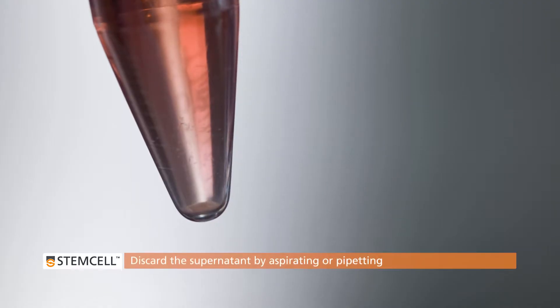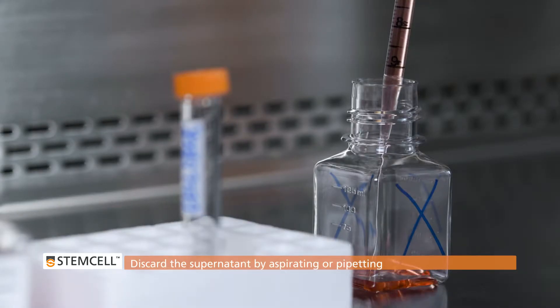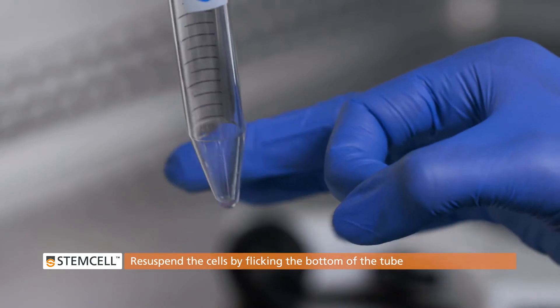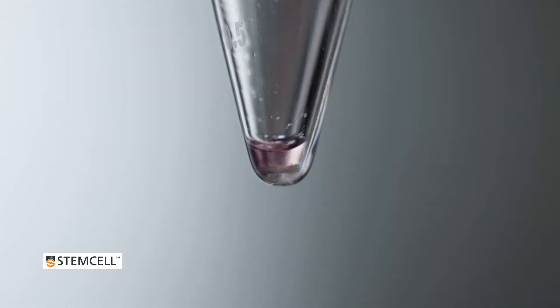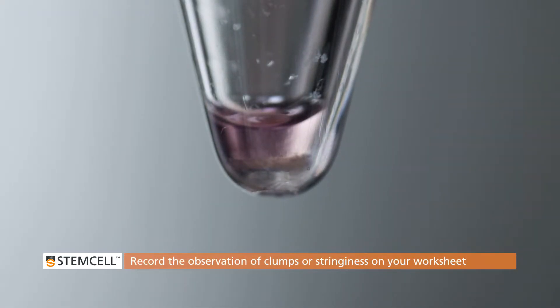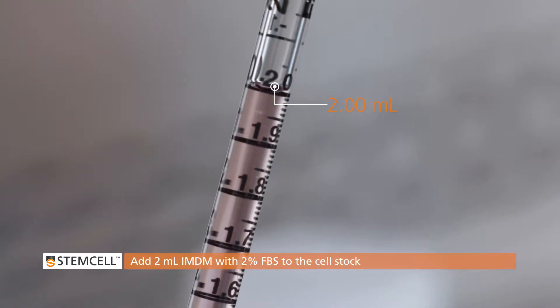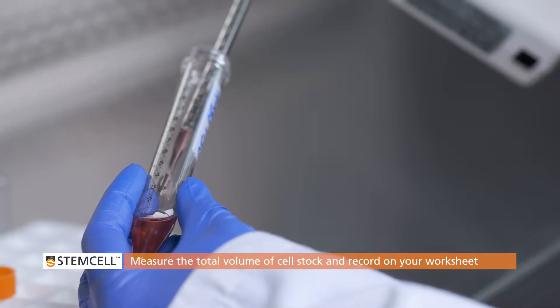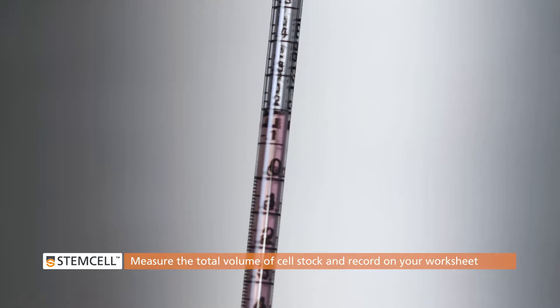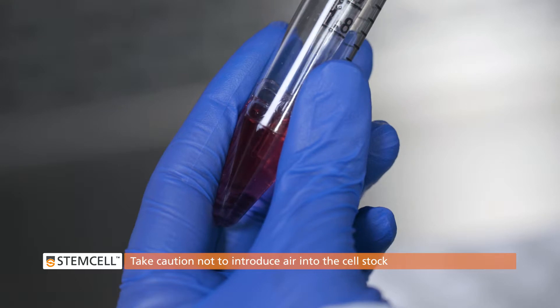Carefully discard the supernatant by aspirating or pipetting — do not pour off. Re-suspend the cells in the remaining medium by flicking the bottom of the tube. The cell suspension should be homogeneous and clump-free. If you observe clumps or stringiness in the sample, please record this on your CFU assay worksheet. Add 2 mL of IMDM to the cell stock. Using a 2 mL serological pipette, measure the total volume of the cell stock and record this value on your worksheet. Take caution not to introduce air into the cell stock while pipetting.